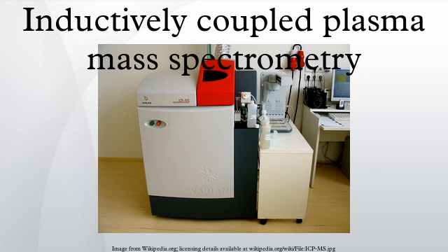Traditionally, ICP-MS instruments have used transmitting ion lens arrangements for this purpose. Examples include the Einzel lens, the barrel lens, Agilent's Omega lens, and Perkin-Elmer's shadow stop. Another approach is to use ion guides to guide the ions into the mass analyzer along a path away from the trajectory of photons or neutral particles.